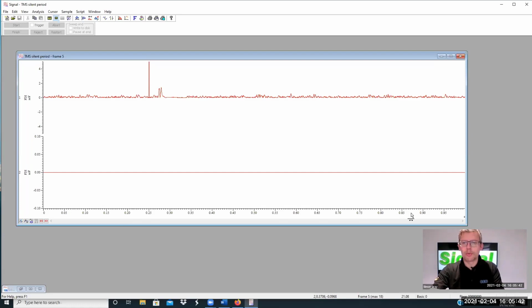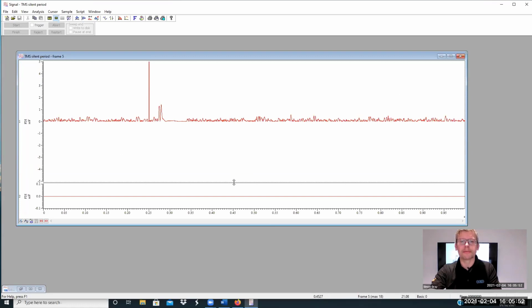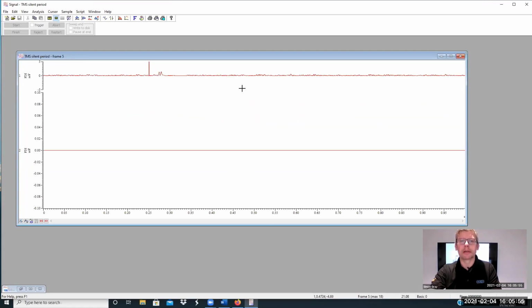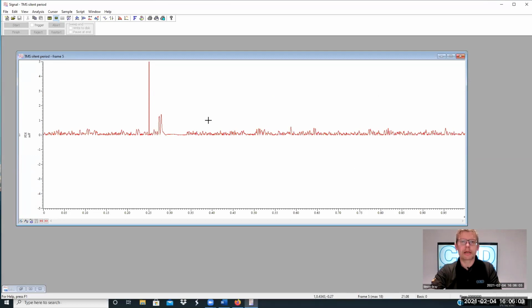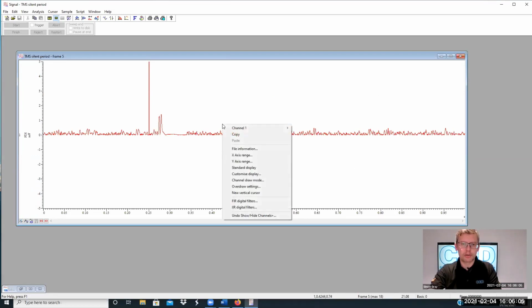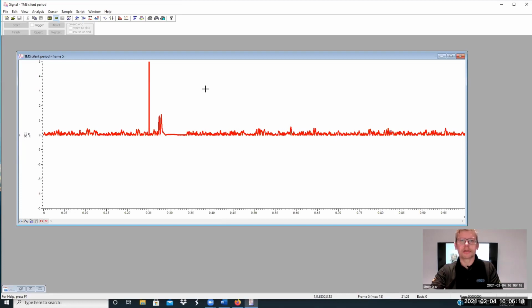Okay, other things we can do with the display here. I did show early on in the week in Spike 2 how we could change the position or amount of space each channel exists in the data document. That's just using shift and clicking between the two. We could double click. We could change the drawing style, and we could change the line thickness, so pen width there. This is more for publication purposes. If I go up to 2 point, you can see how it's thickened up now.